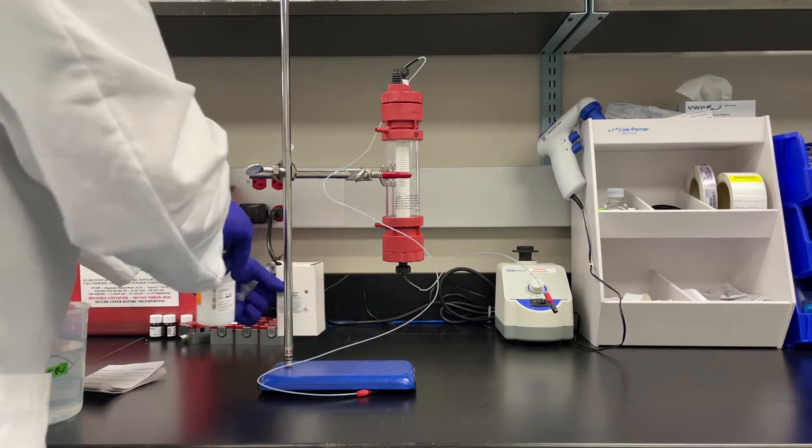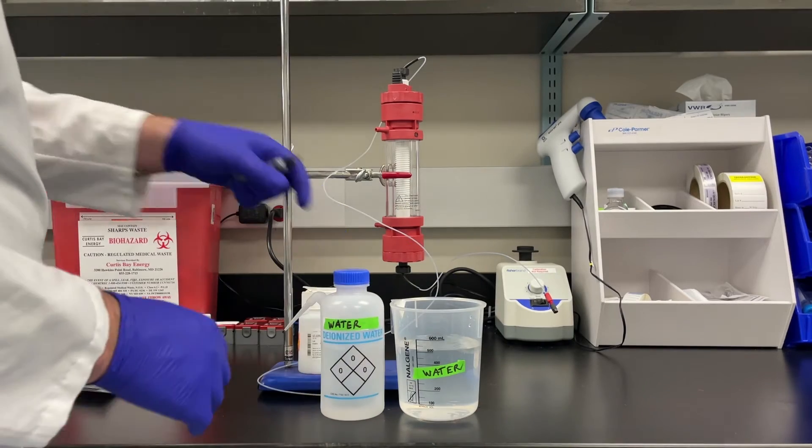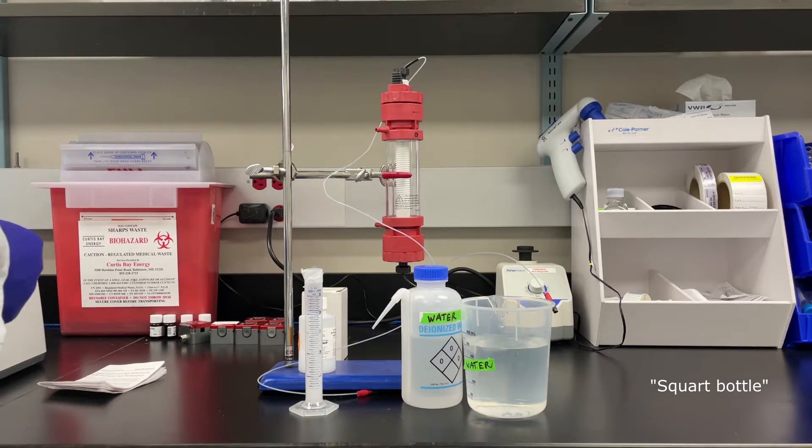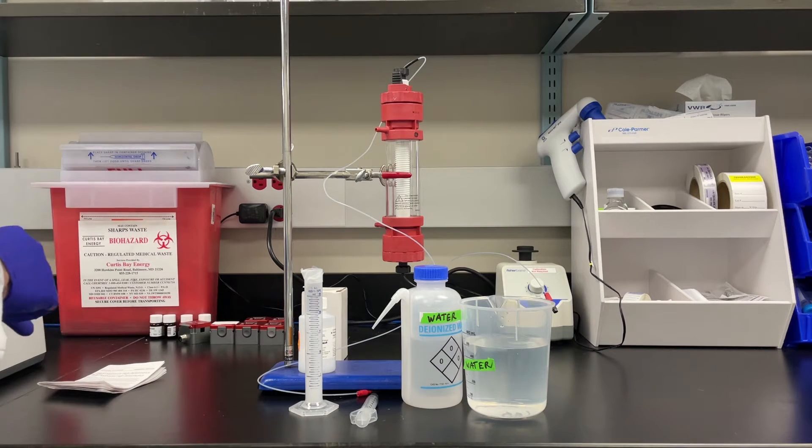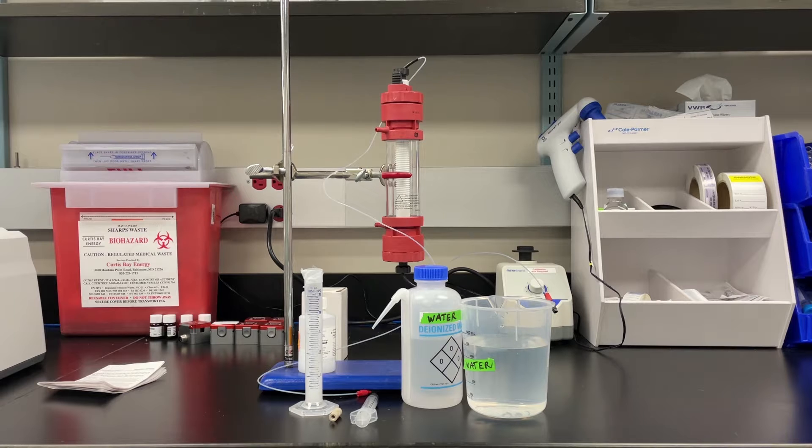To pack this column, we're going to need the resin that's in the bottle, some water, and a water bottle that has a little spout on it, the resin that was in the graduated cylinder, a syringe, and an adapter that'll allow us to attach the syringe to the column.